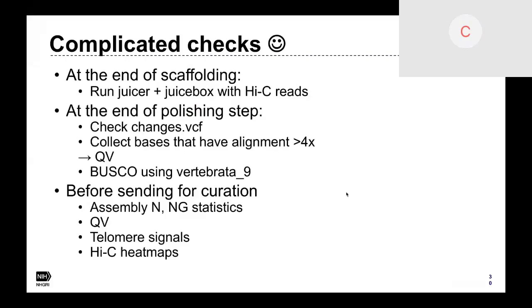So I just wonder, have you verified that Arrow can join the contigs within the scaffold? Basically I have two concerns. First, have you verified that the Arrow app that we provide can join the contigs within a scaffold? And second, because there's going to be some joining going on here, are you concerned that if we leave the mid scaffold from the Hi-C and let it run through Arrow polishing, we're going to have an event that basically messes up the joining of the contigs during the Arrow polishing?